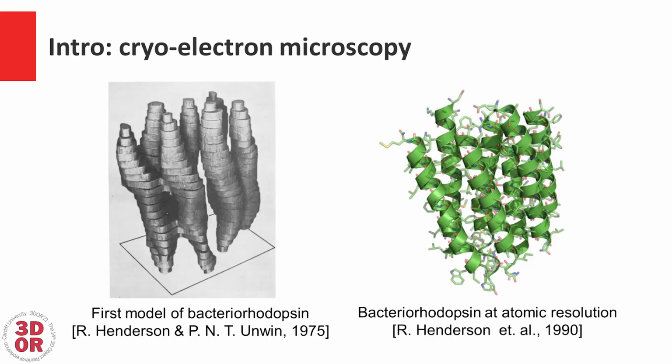And finally, Richard Henderson, the third Nobel Prize winner, was the first person to actually achieve atomic resolution with cryo-EM in 1990. Since then, there were many improvements in detector technology and processing hardware. Now, cryo-EM researchers obtain atomic resolution structures almost routinely. However, what I described is known as a single-particle cryo-EM.